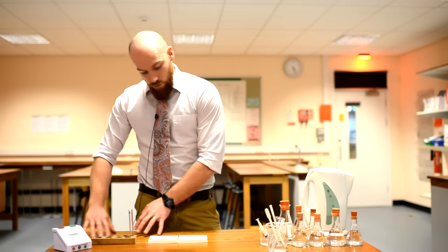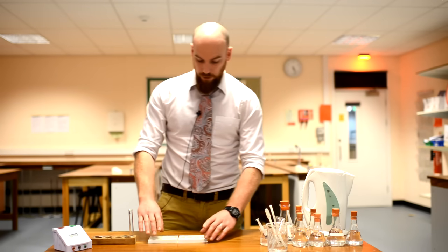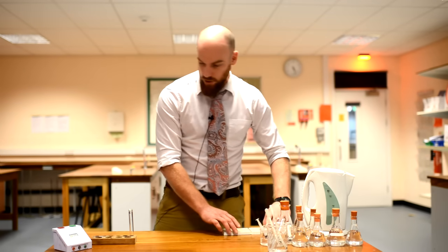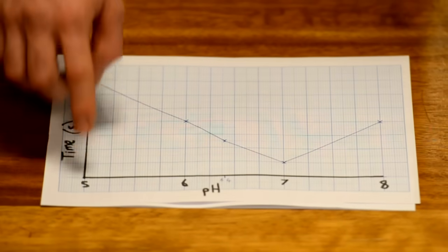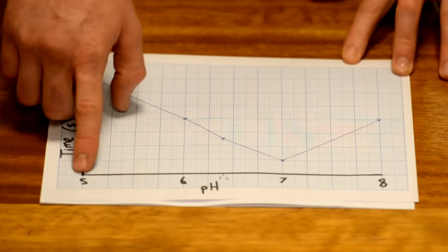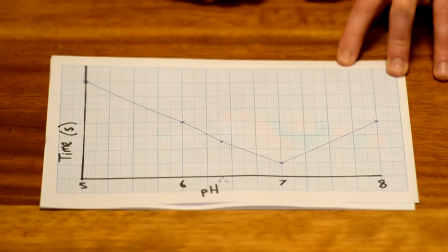Then you would repeat the test with a different pH and hopefully gain some results not dissimilar to this one where you can see time increasing on the y-axis and pH on the x-axis, and the optimum pH you would expect is 7.